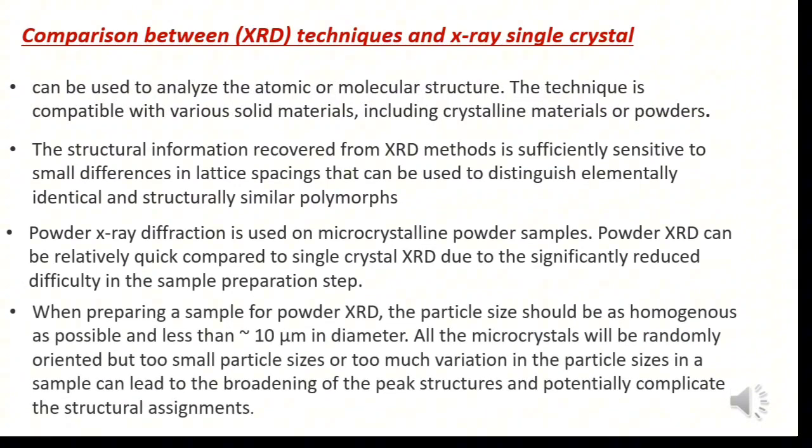And we will study today X-ray single crystal. Comparison between X-ray diffraction (XRD) and X-ray single crystal: XRD can be used to analyze the atomic or molecular structure of materials. The technique is compatible with various solid materials, including crystalline materials or powders. The structural information recovered from XRD methods is sufficiently sensitive to small differences in lattice spacing that it can be used to distinguish elementally identical and structurally similar polymorphs.